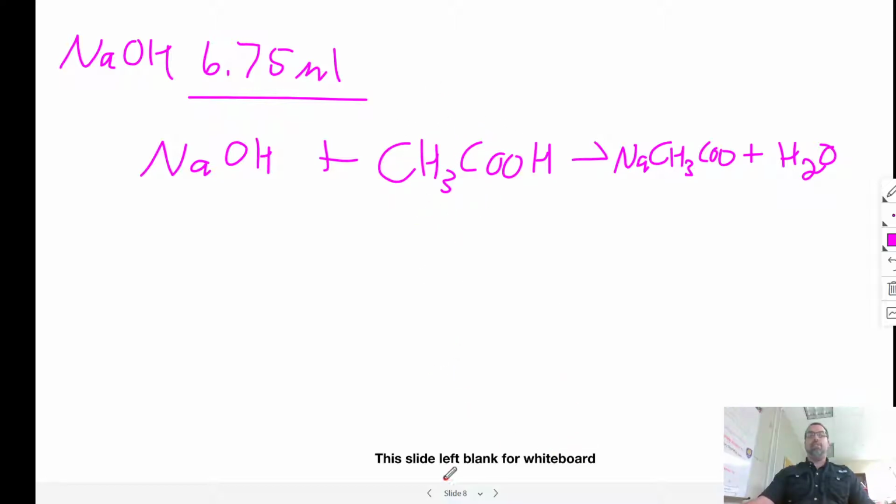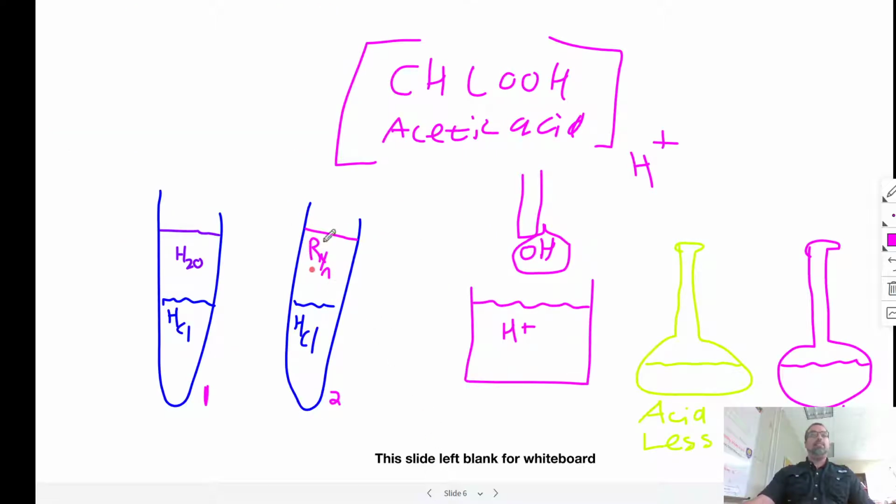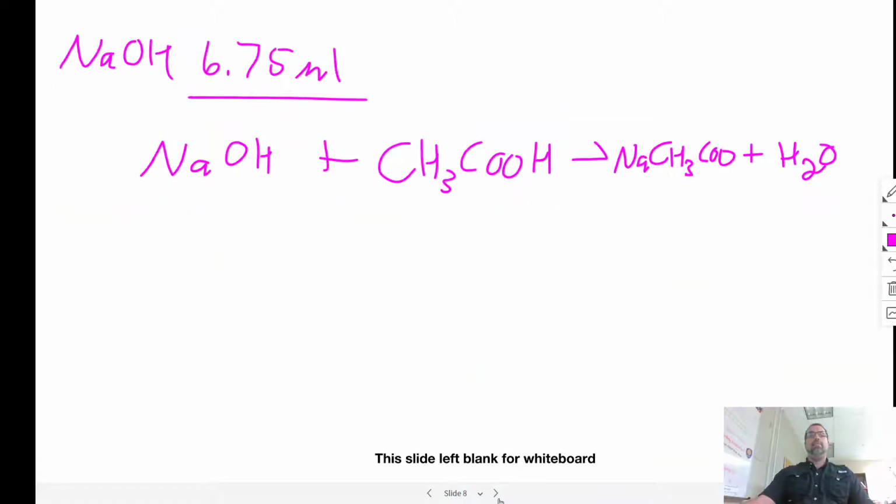And this volume, remember, is this that's right here, okay? So the moles of this in here is going to equal the moles of this that we use to cancel it out, okay?